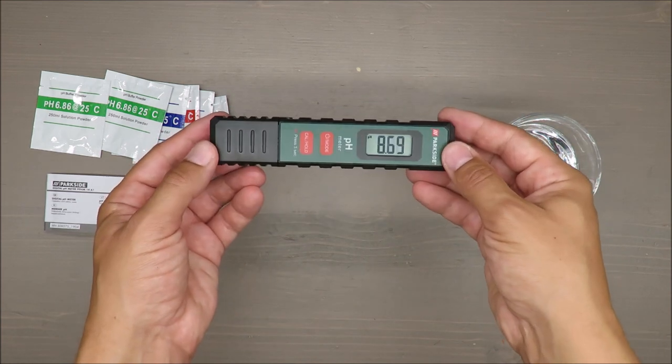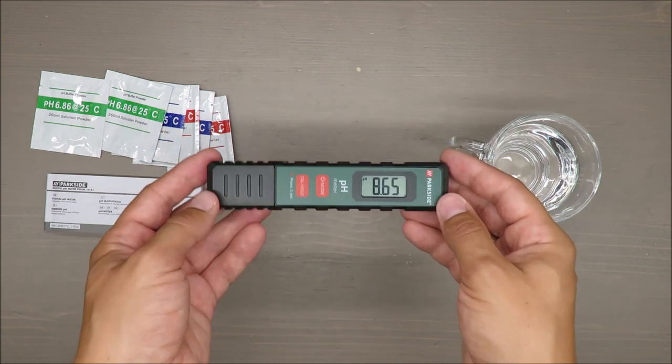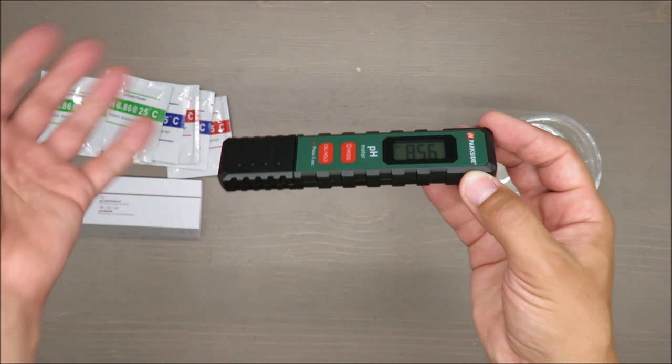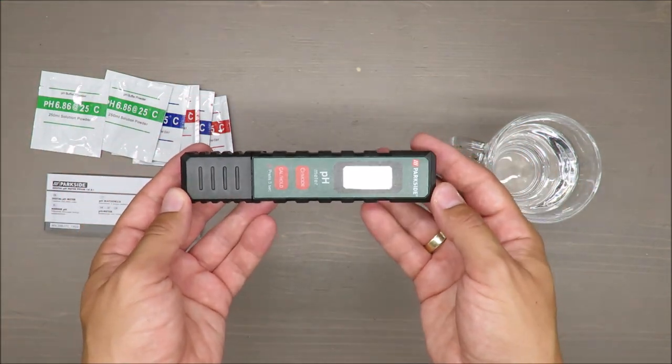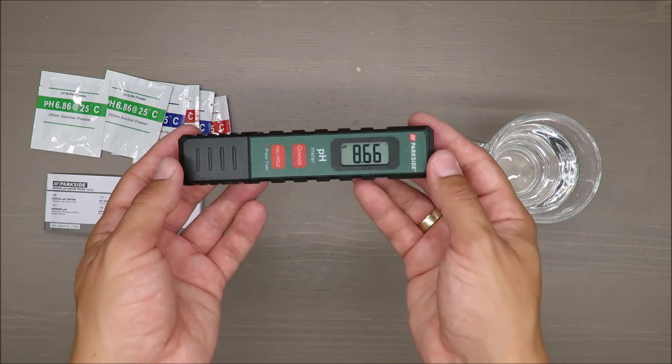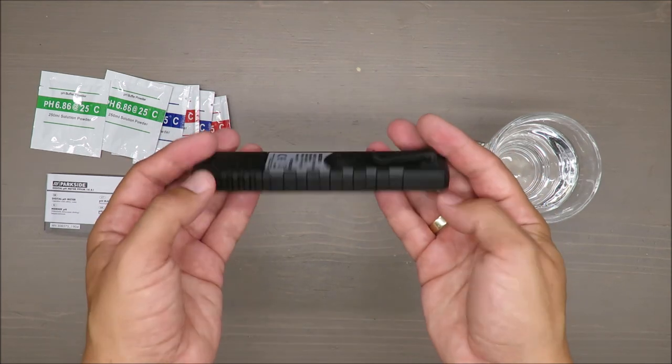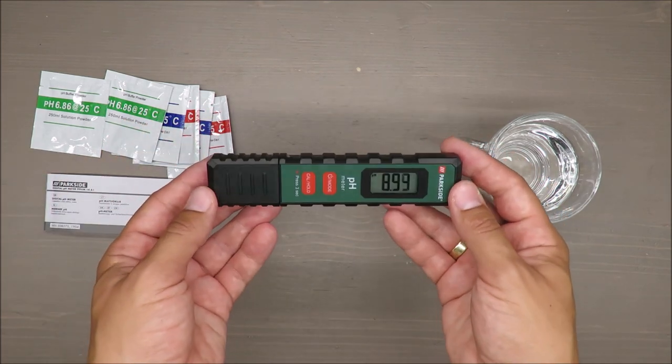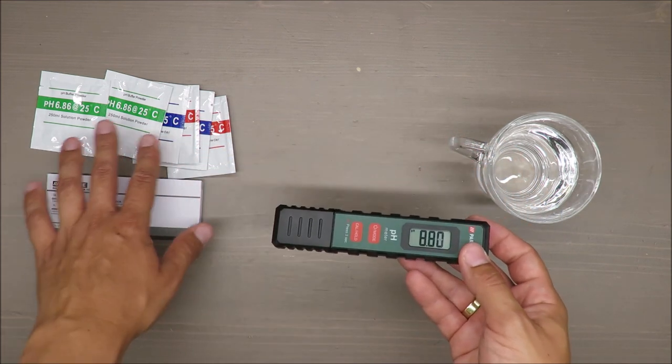But for beers, for instance, we are ending in the level of 4.5. And for those who are curious about vodka, because if I mention beer vodka should be mentioned as well, vodka is reaching, depending on the brand of course, but it's around 9. So this is real life fluids that you can consume. And yes, I should make a calibration, but on purpose I will not do it.